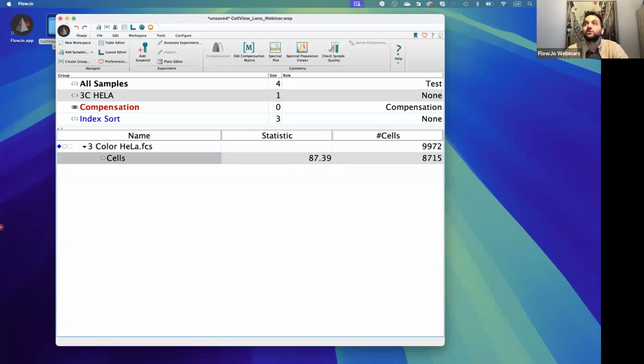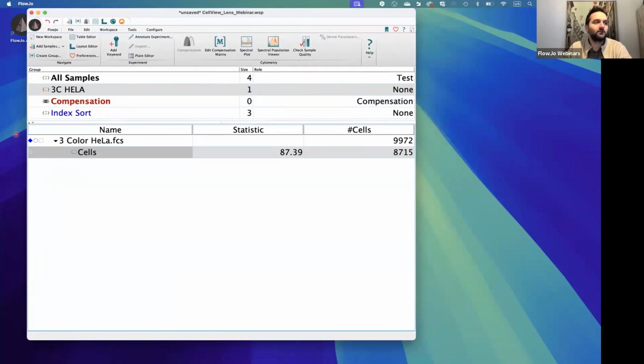You can extract your CVW file there and then import it to Flowjo, but the computational power would be from your own computer and not the cloud. It's just for the storage at this point. Okay. All right, no problem.